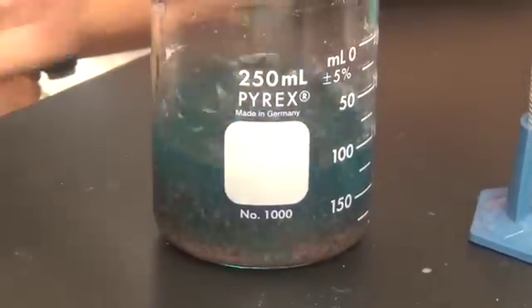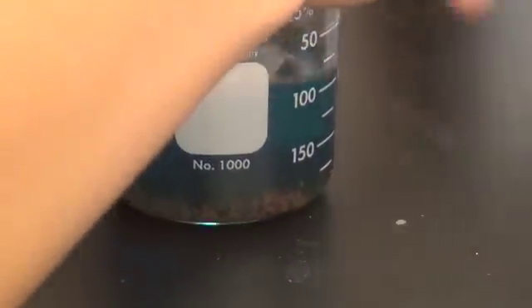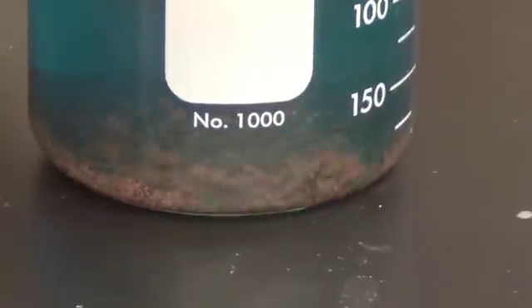Stir, Matt, stir. Oh yeah, that definitely looks bad. Oh, wow. Yeah, that's definitely coffee.